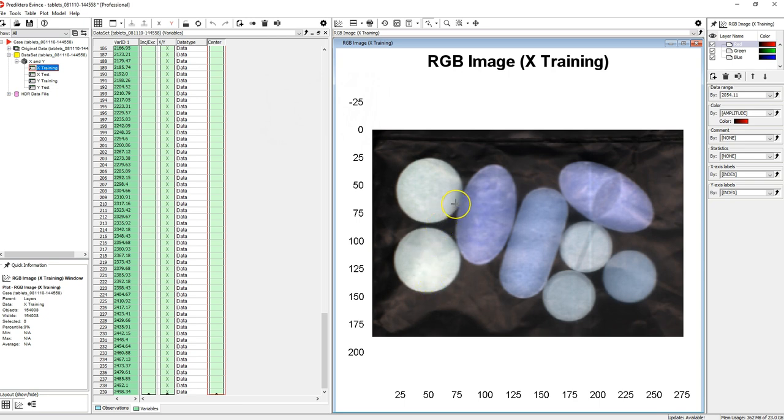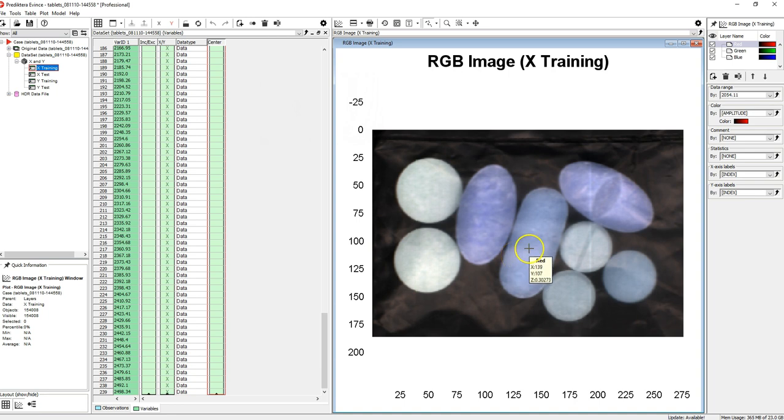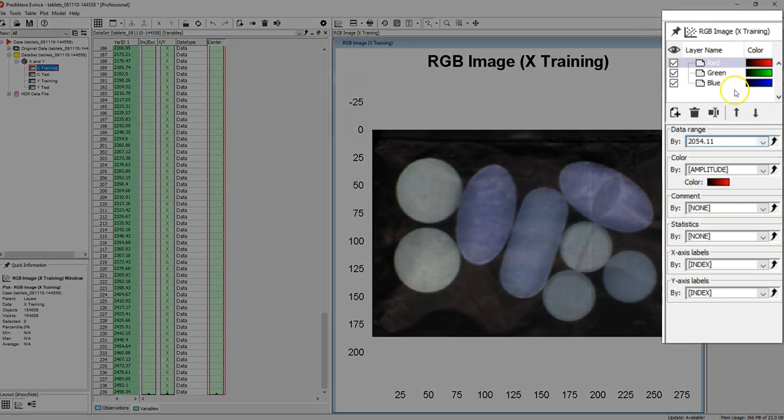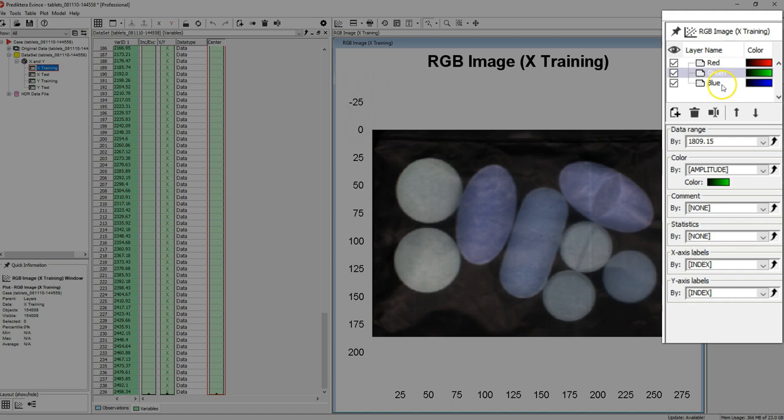You will now get an image that is a visualization of your imported image file as a pseudo RGB image based on three spectral channels. In the settings menu on the right you can see the default spectral bands used for red, green and blue color.